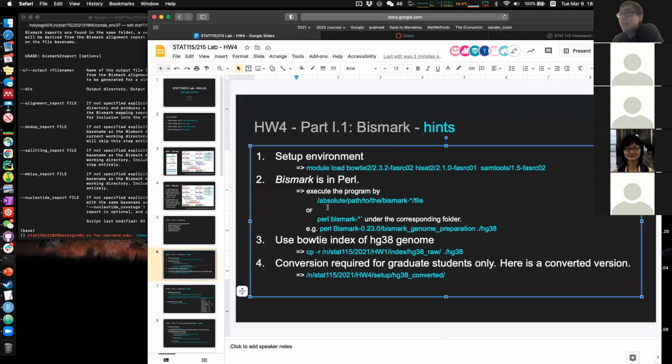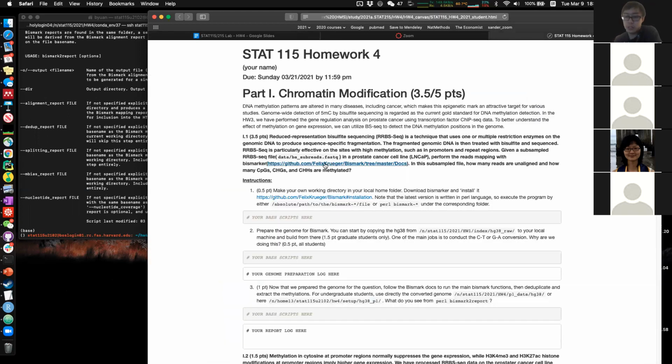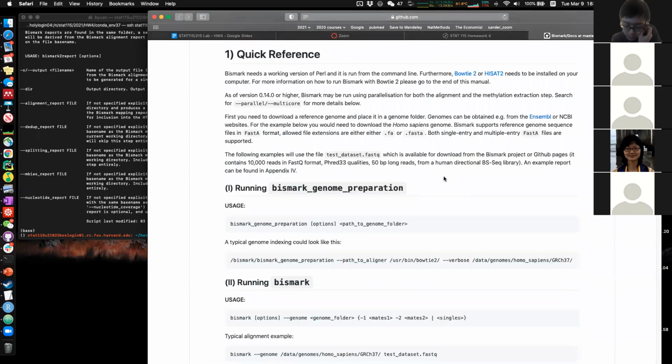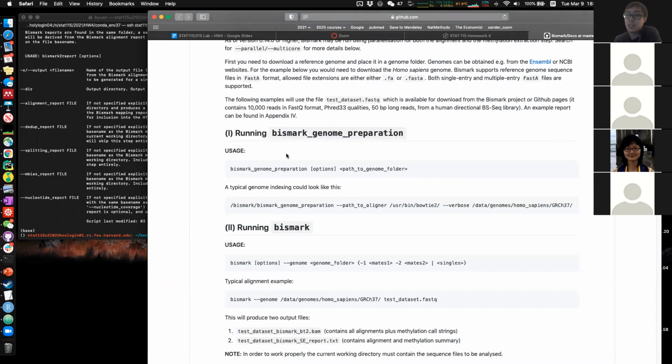Yeah. So that's how you call the Bismark commands. With all this, I think you'll be able to follow the document that is written here. They have multiple different tutorials, step by step, so you just follow their steps.